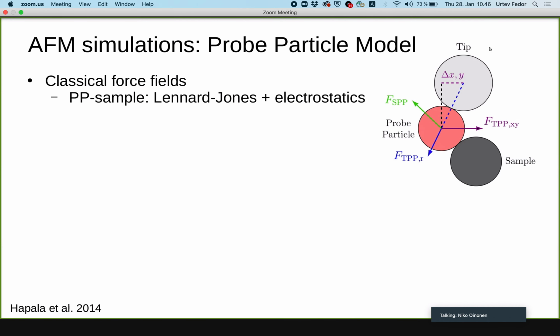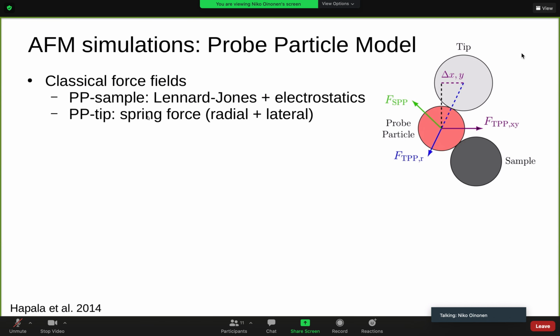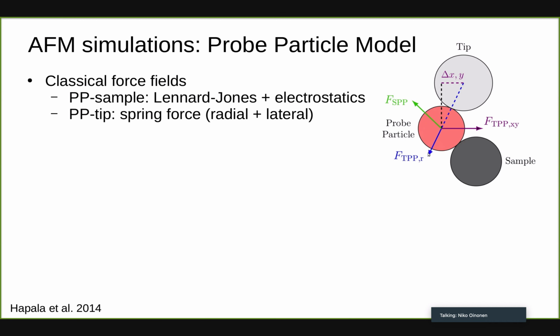And then the probe particle interacts with the tip using a spring force, which has two components: a radial component, so how far is it from the tip, and then the lateral, so how far is it from the equilibrium position below the tip.